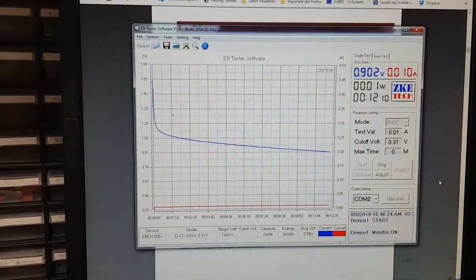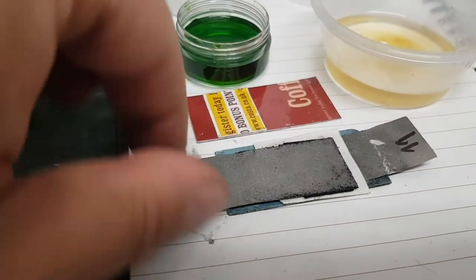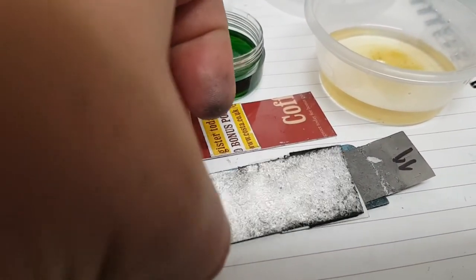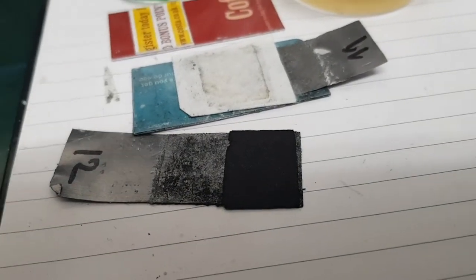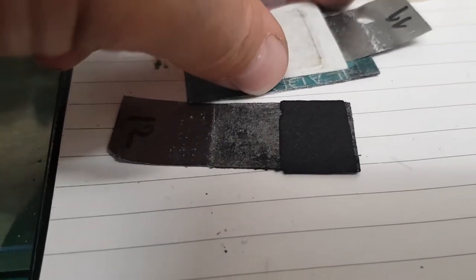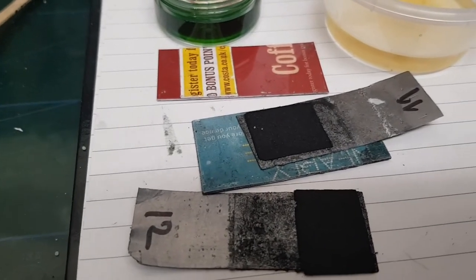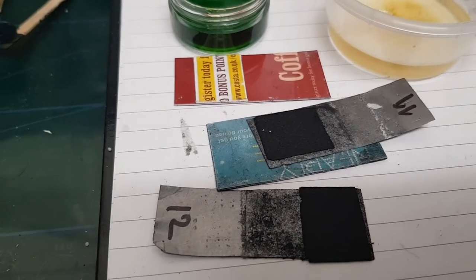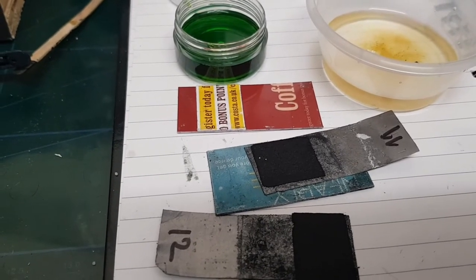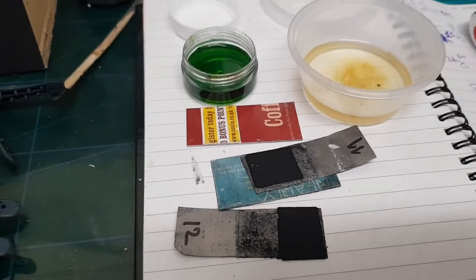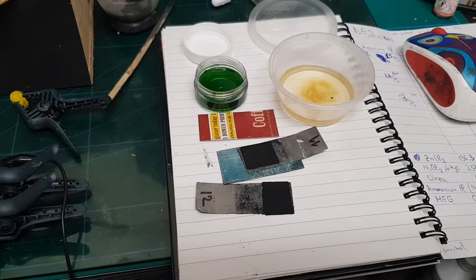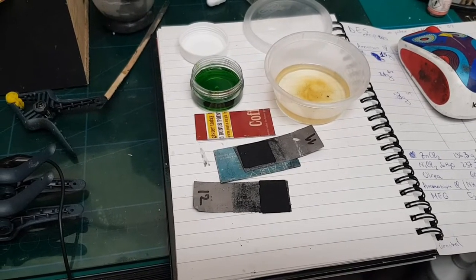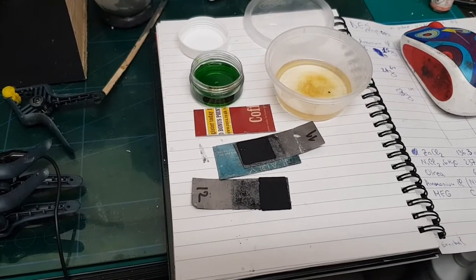I have here another prepared device with the active material, filter paper, and another active material layer. I'm going to add the deep eutectic solvent based on ammonium and urea as electrolyte. I'll pause and come back when the discharging curve is finished to see how this supercapacitor performed.